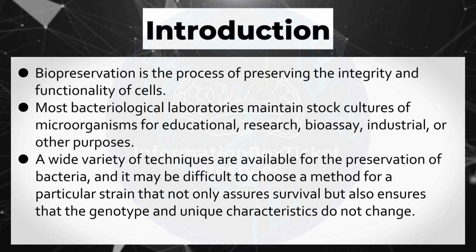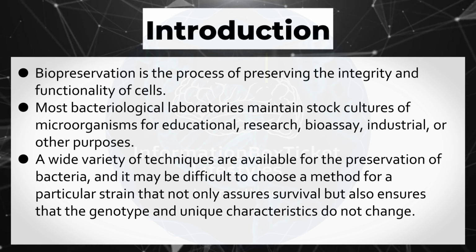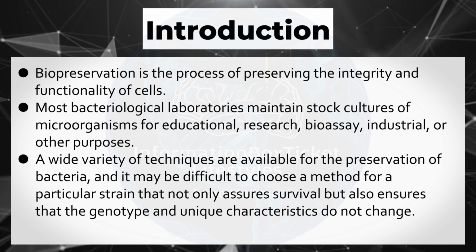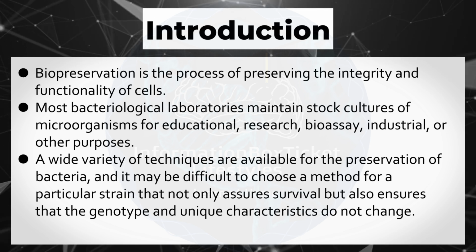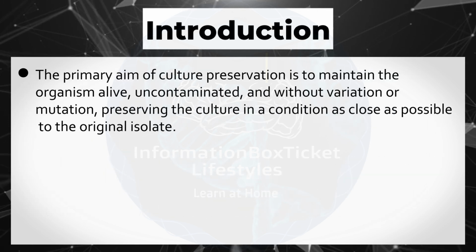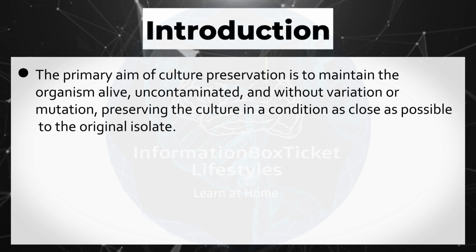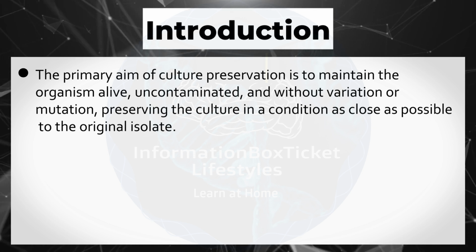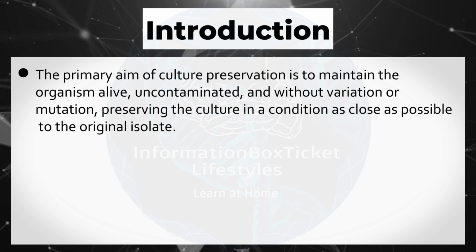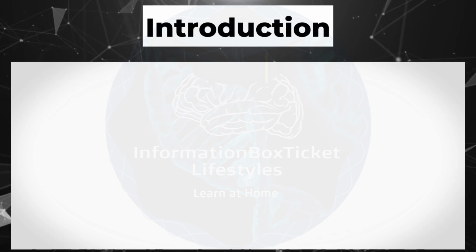A wide variety of techniques are available for the preservation of bacteria, and it may be difficult to choose a method for a particular strain that not only assures survival, but also ensures that the genotype and unique characteristics do not change. The primary aim of culture preservation is to maintain the organism alive, uncontaminated, and without variation or mutation, preserving the culture in a condition as close as possible to the original isolate.